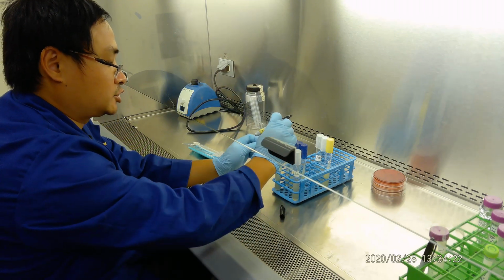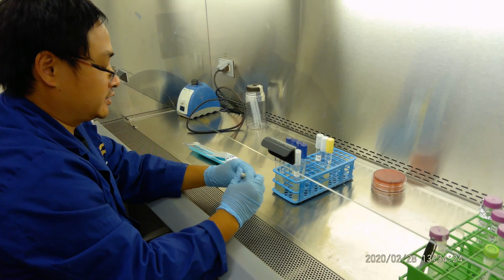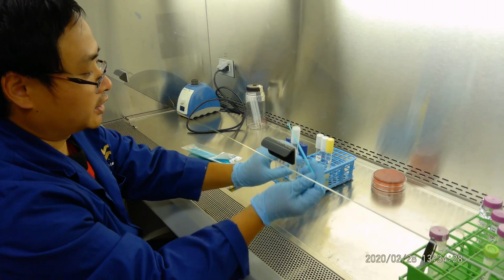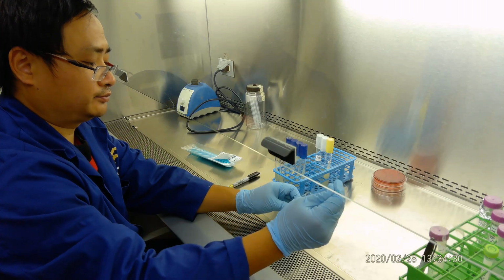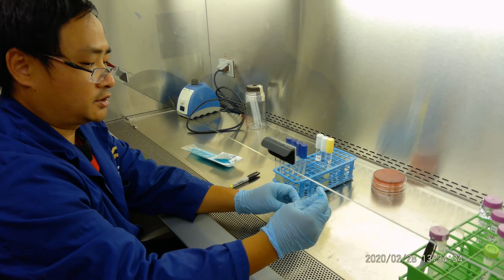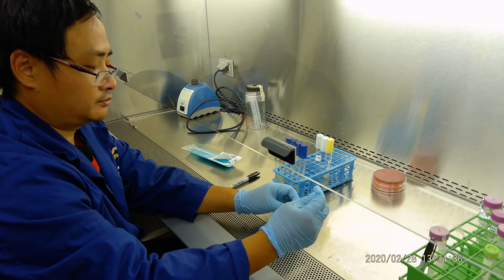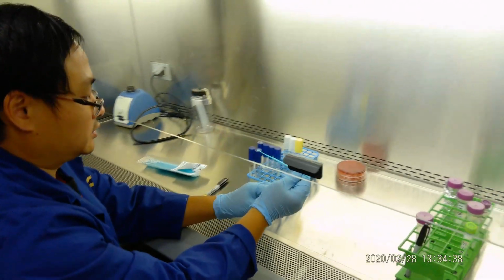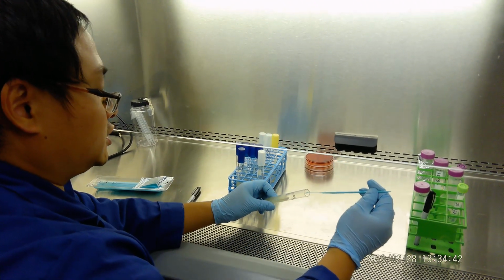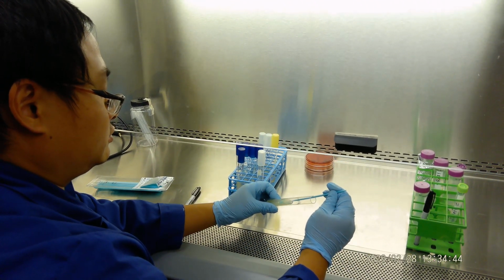So we do a streak plating. That's very simple to do. You get a loop and pick Serratia. Take a picture like that. Then we streak it. That's what we do, a zigzag streak.